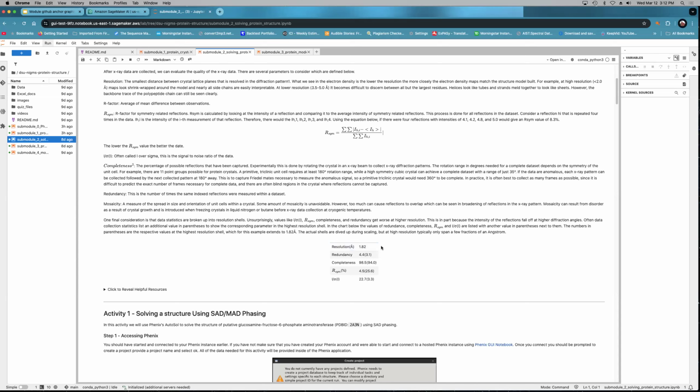Some residues start to blend together, like a valine and a threonine residue are going to look very similar, and cysteine and serine are going to look similar. So some of the residues that are not necessarily isosteric, but kind of the same size, would be hard to interpret. But as long as you know what the sequence is, you should be able to fill in the correct residue. But it does make things a little bit more difficult to work with, especially in regions where maybe the electron density from the maps that we generate with this method is not very good.